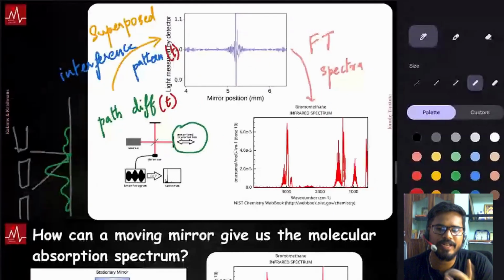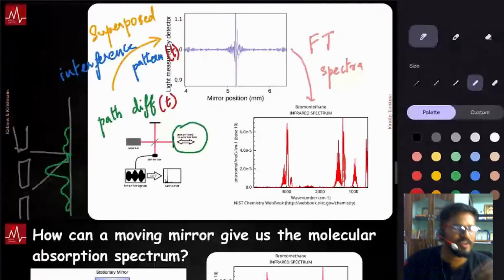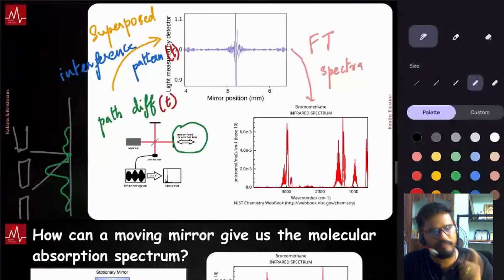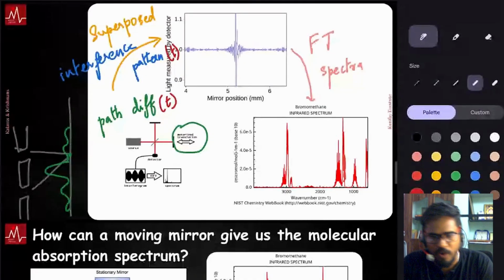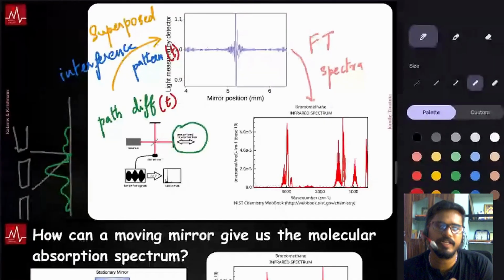This is a very good engineering example. Using the mirrors, you are again getting molecular vibrational energies. How do you even do that? This is because of very clever engineering that is based on fundamental physics and mathematics. Not an easy setup, but still certainly understandable.